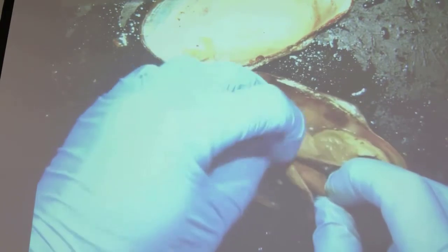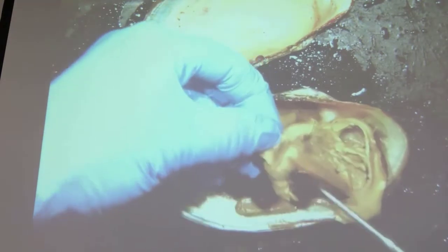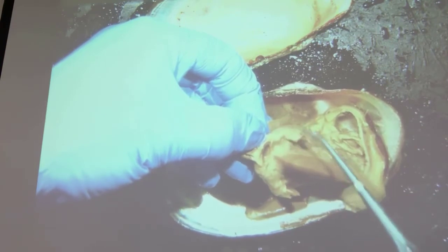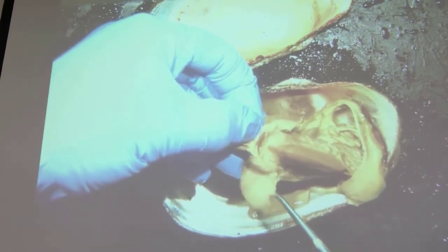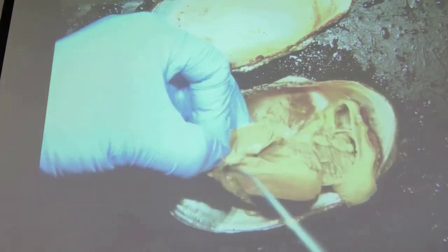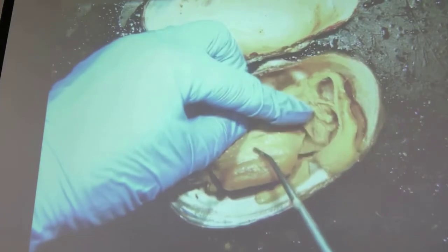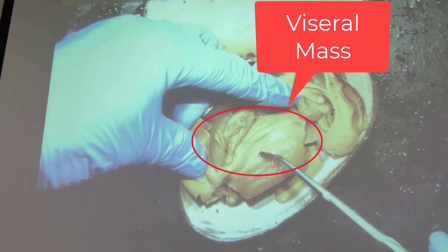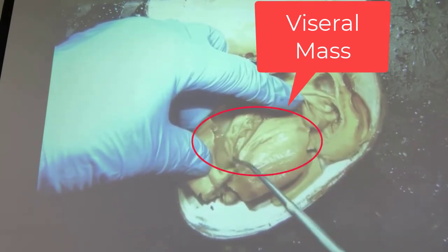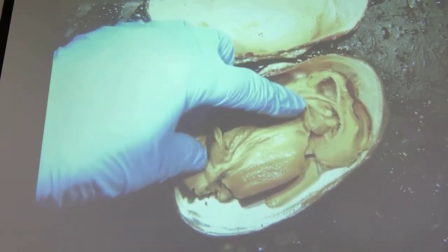So we're going to continue our dissection of the clam. First, we'll locate the mouth here. So this is the mouth right there. Again, on either side are the labial palps to help direct food towards the mouth. We're going to cut open the visceral mass where most of the organs are found. That is another key feature of the phylum Mollusca, the visceral mass. So the mantle, muscular foot, and visceral mass are the three key features of the phylum Mollusca, characteristics that unite the group.